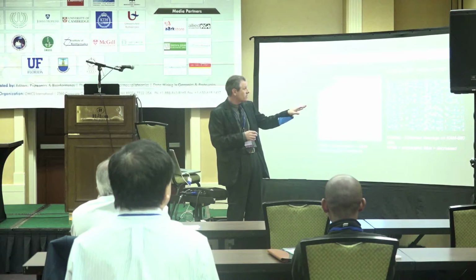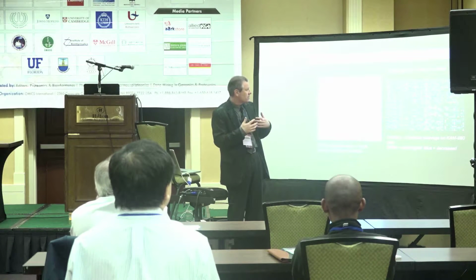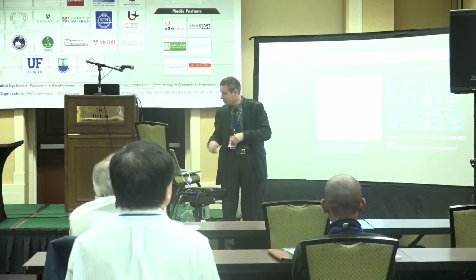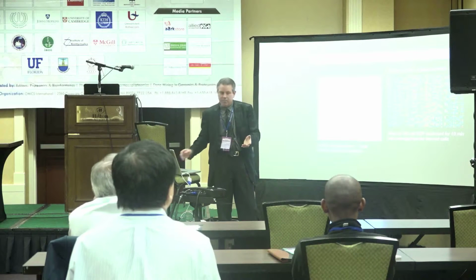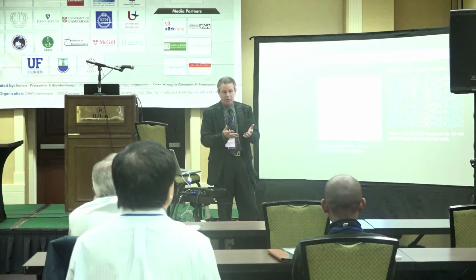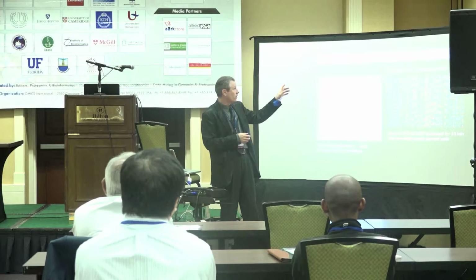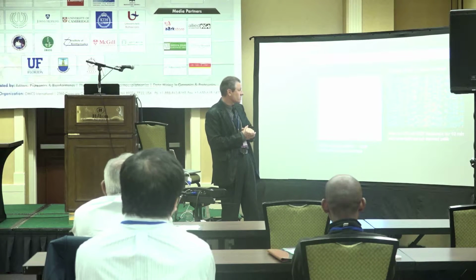But what's white is unchanged. And there are a few red spots, tiny ones, where occasionally you expose an epitope a little bit better when you do the chemical cleavage. So that's what we tend to do now, and we recommend that for measuring the levels of expression or phosphorylation of proteins using the standard Kinex antibody microarray, the KAM type analysis.